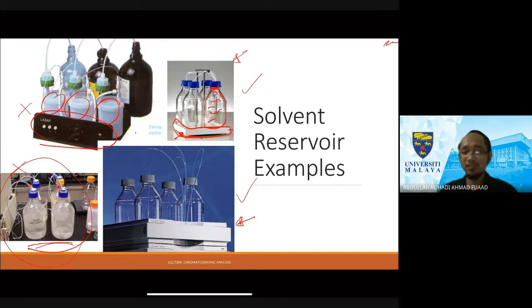Even if that person knocked it on the table, there will still be spillage. And depending on your table, for example, if your table is wood and the chemical is organic or slightly acidic, then you can cause more harm or damage to your property. So these two are the best.